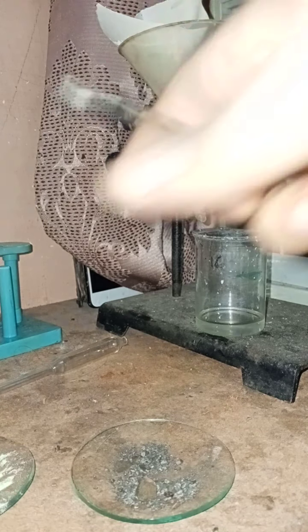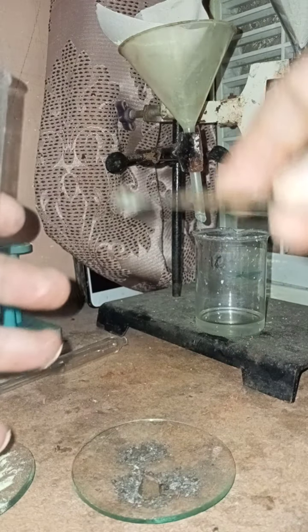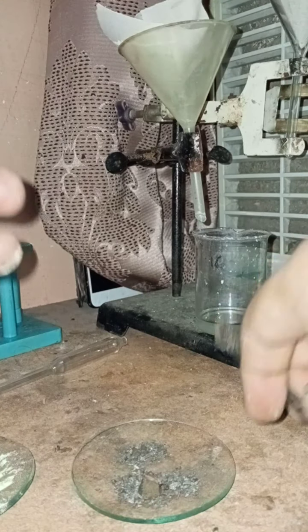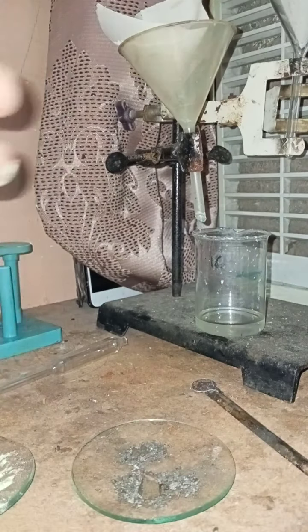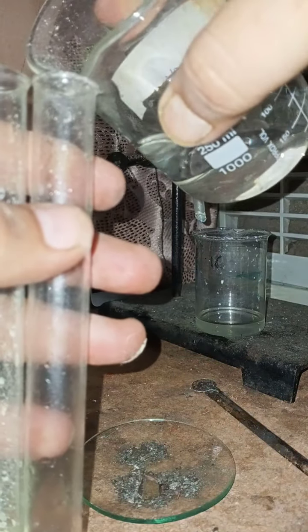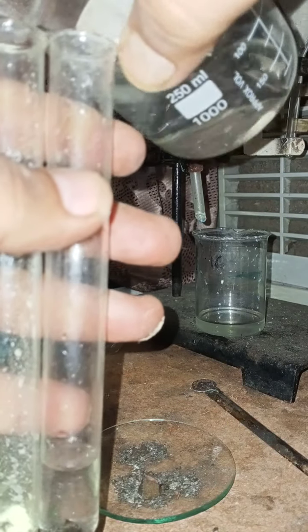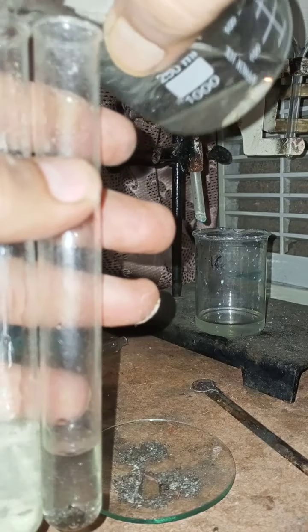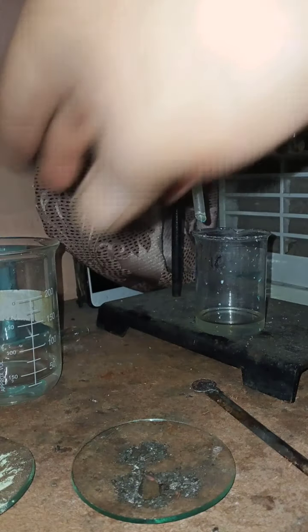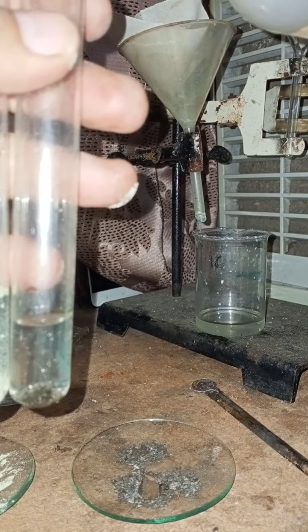In one I am going to add the mixture, and in the other I have added the compound. Now I am going to add a small amount of water so that we can have the reaction in an aqueous medium, and then I am going to add a few drops of acid, and let us see what happens.